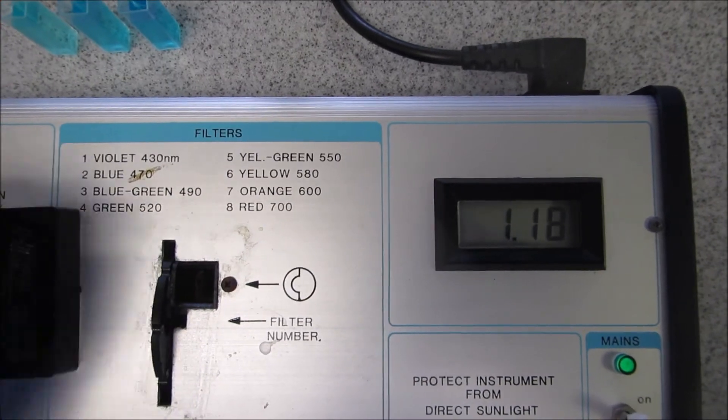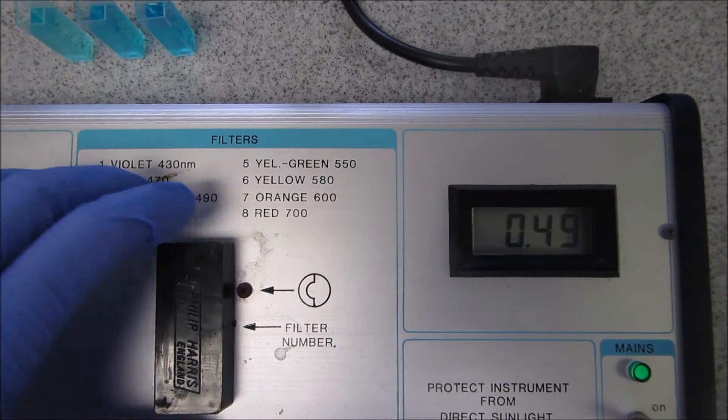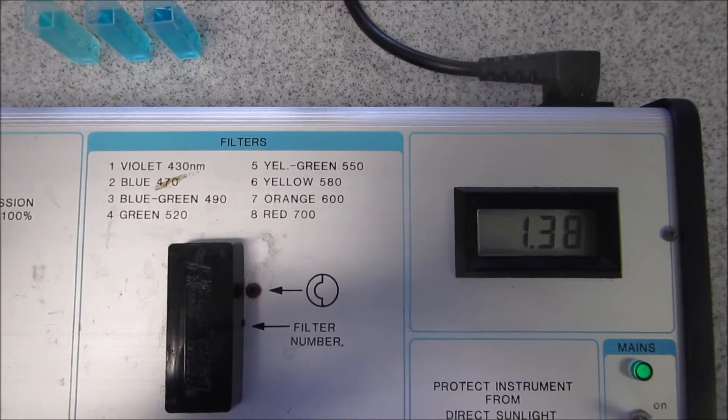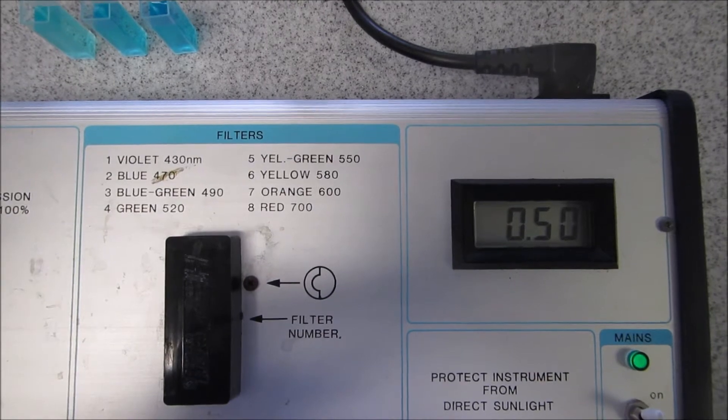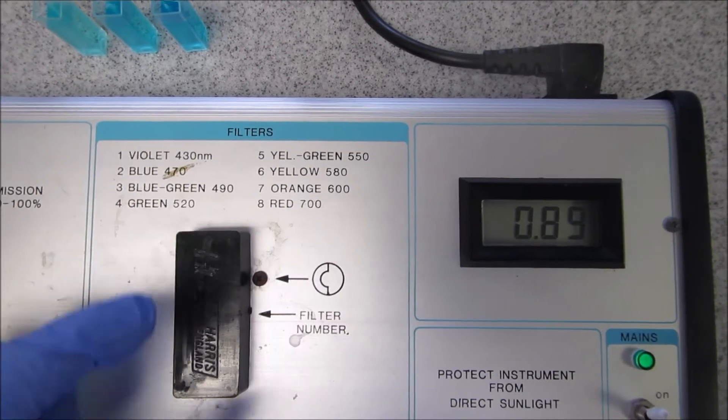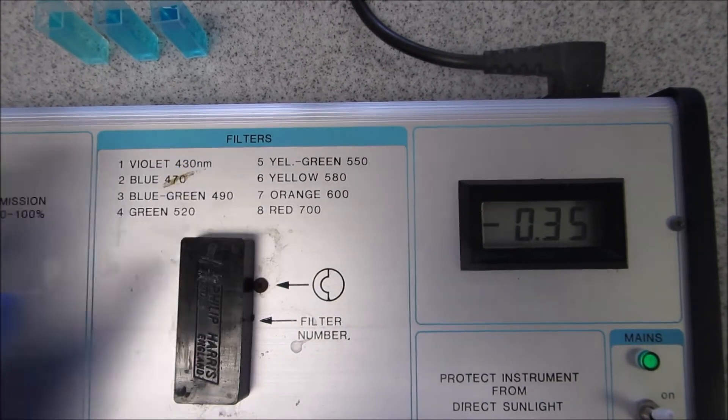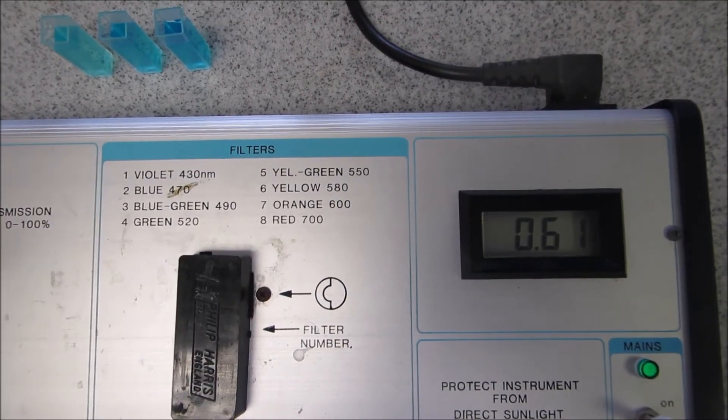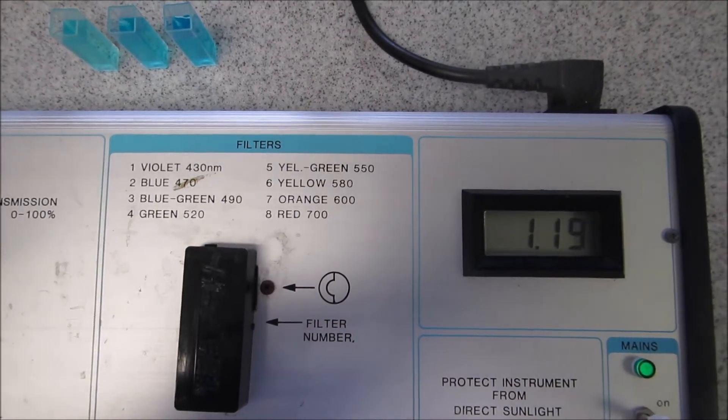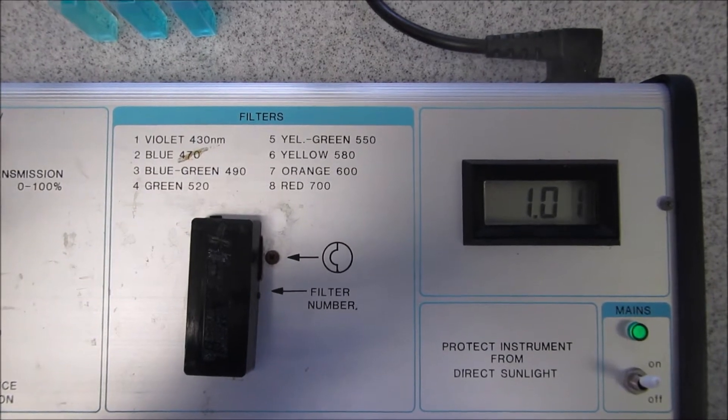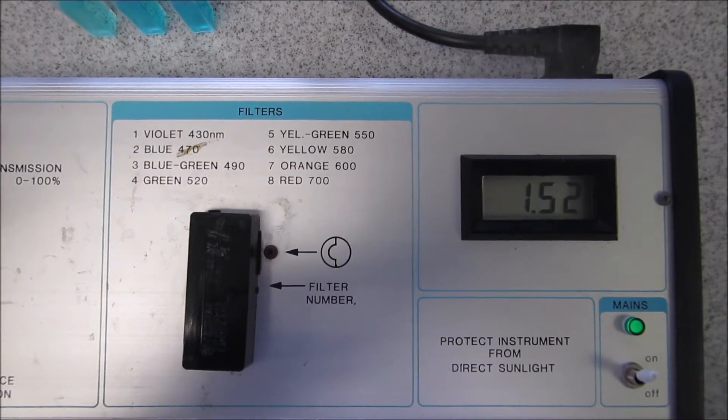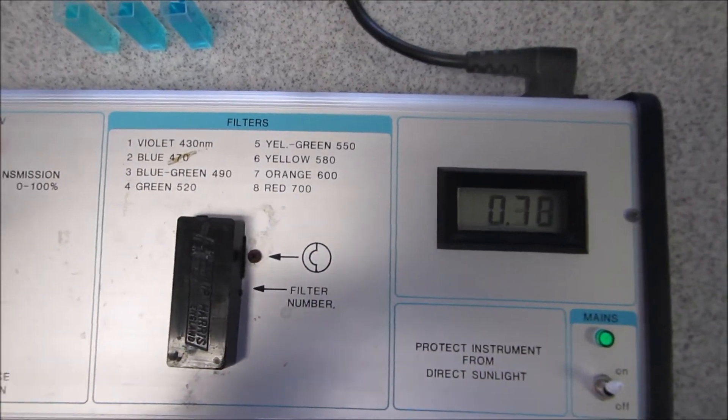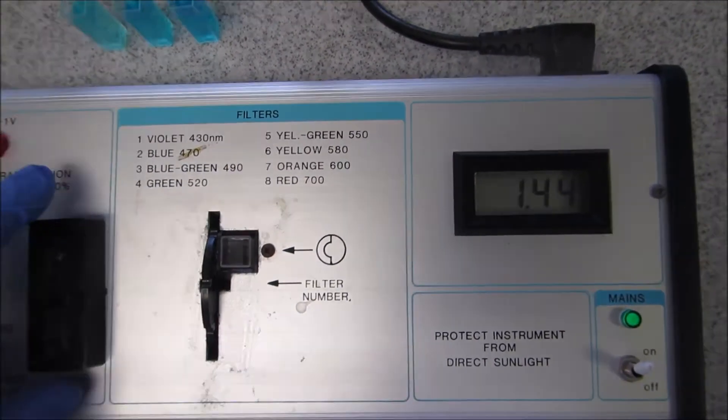Now I'm going to take it up to number 6 which is 580 nanometers and zero it again with my blank. Sometimes it can take a while to blank, and if it doesn't look like it's going to go I'm going to try adjusting. If after a while it will not settle, you may have to just skip that one. I think I'm going to skip it.